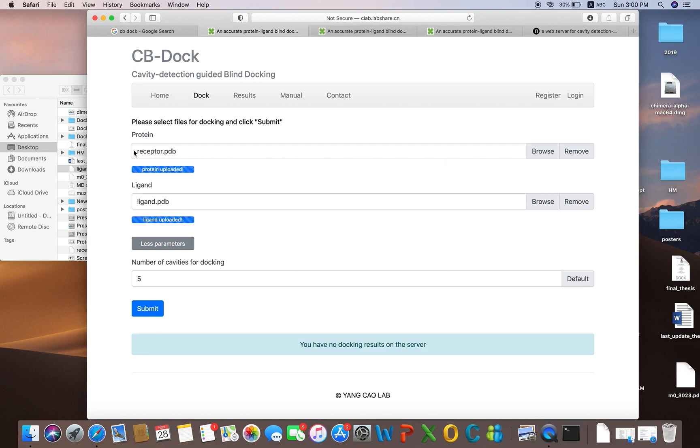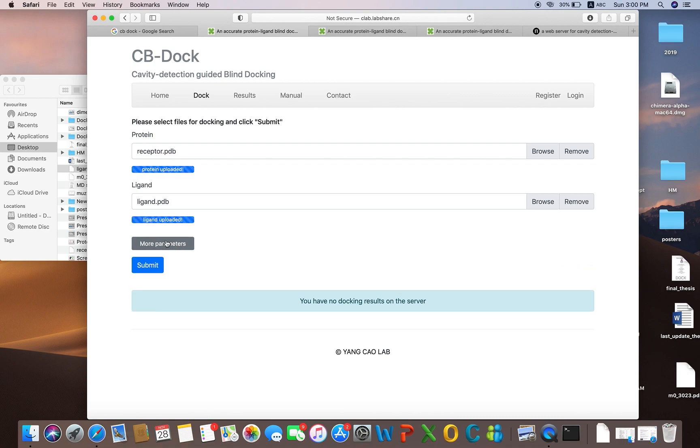We have given the receptor or the protein and we have given the ligand. There is a tab which shows more parameters — you will have to click on it.